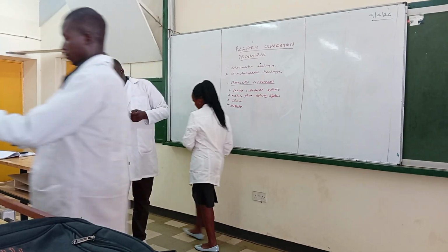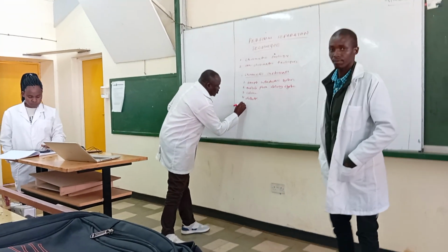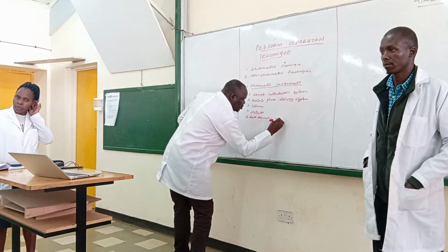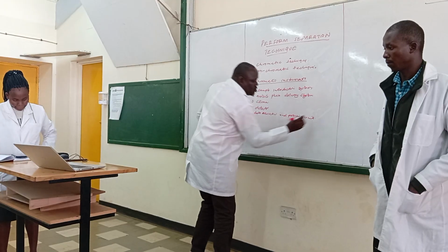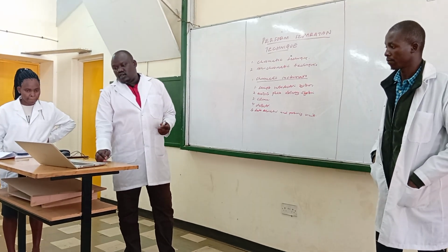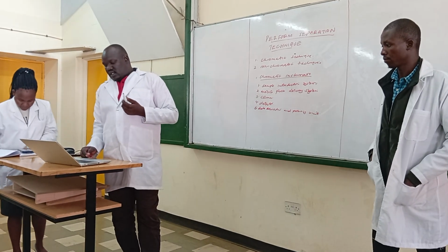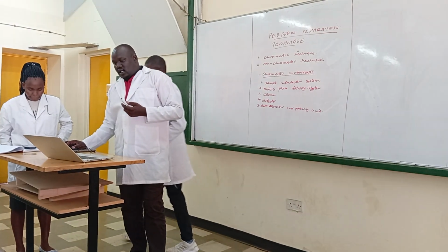And the last one is the data acquisition and processing system. Once you have detected, you process the data in the processing unit. It records, displays, analyzes, and detects signals to generate chromatograms. It also quantifies the results, which means it shows the peak heights and concentration calculations.